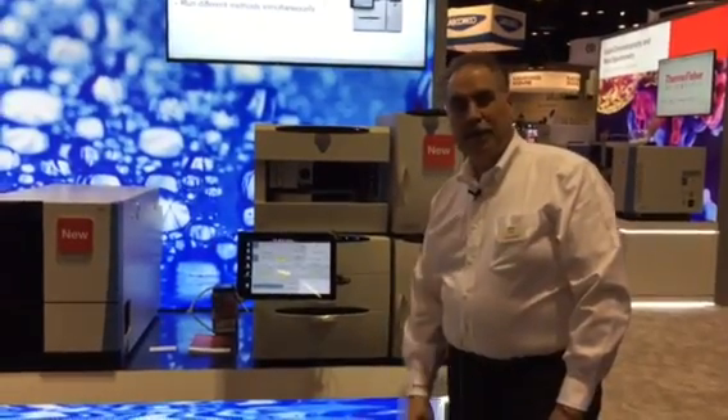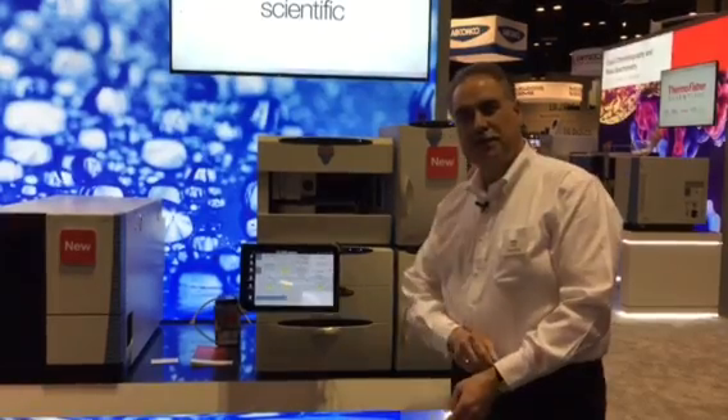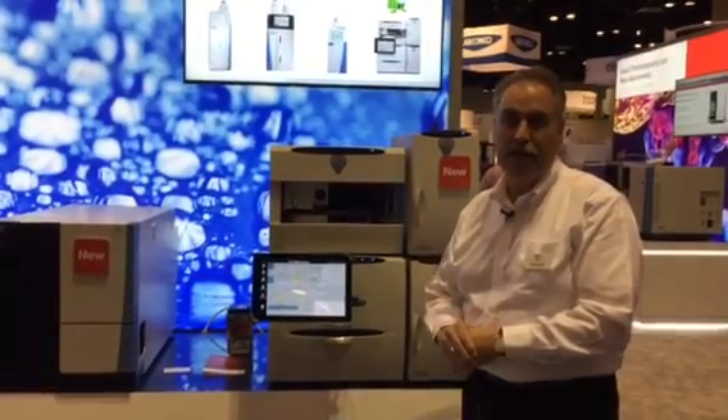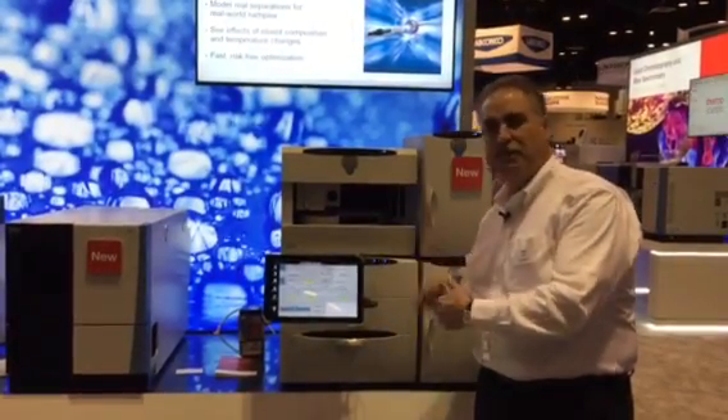Hi, I'm Mike Doyle. I'm in the ICSP product group and I'm here to introduce the ICS-6000 for our ion chromatography systems. This is our high-end system — our newest in the line of high-end systems that we have. We've introduced some customer-facing features as well as some performance features.